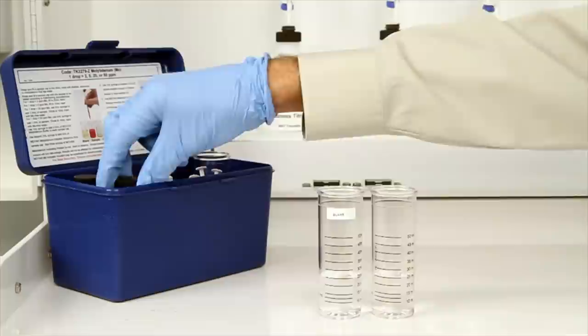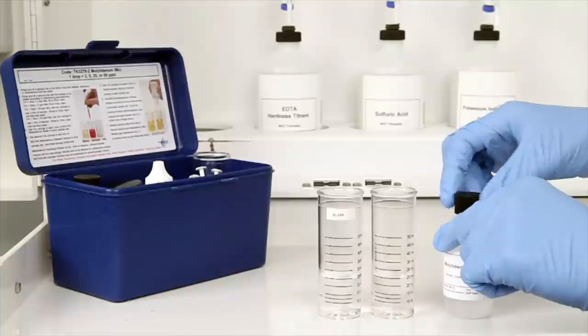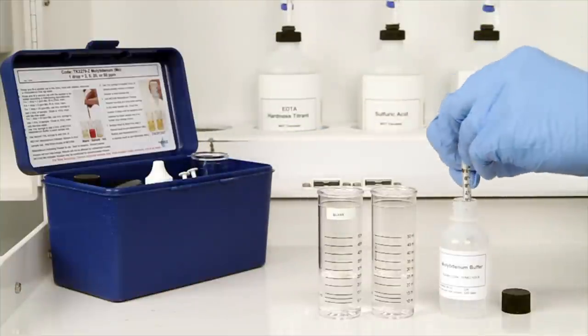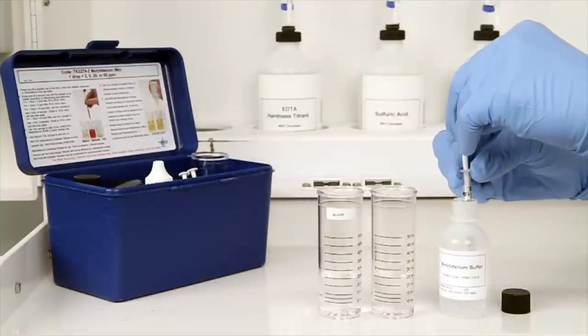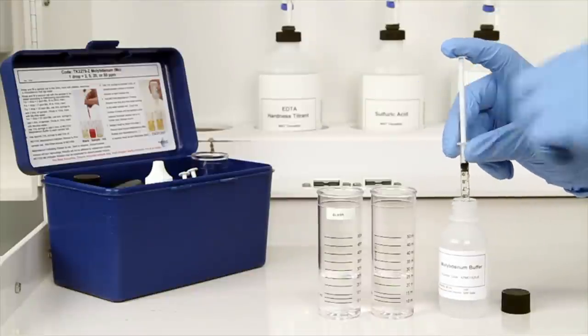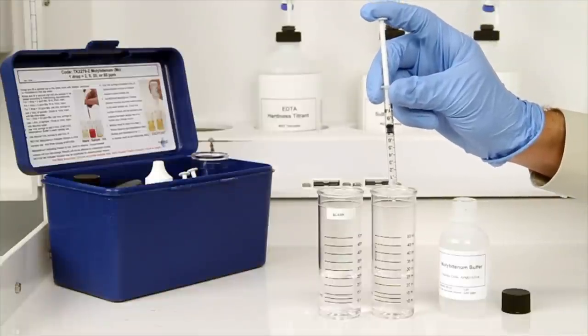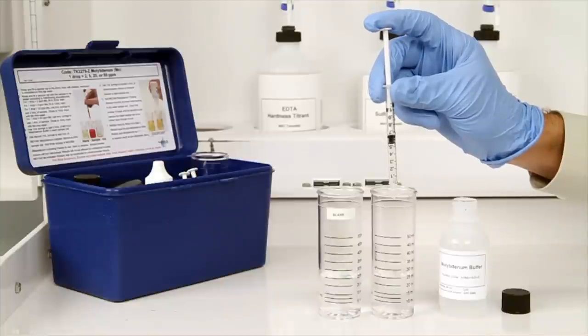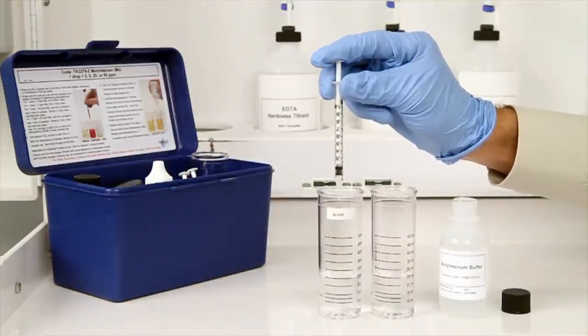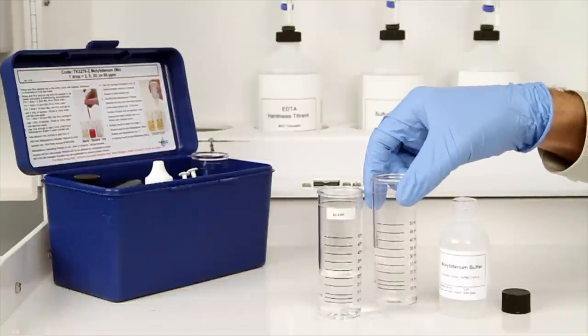The next step according to the endpoint ID procedure is to use a one milliliter syringe to add half a milliliter of molybdenum buffer to each of the sample vials prepared in the previous step. After the addition of the reagent, swirl the vials to mix.